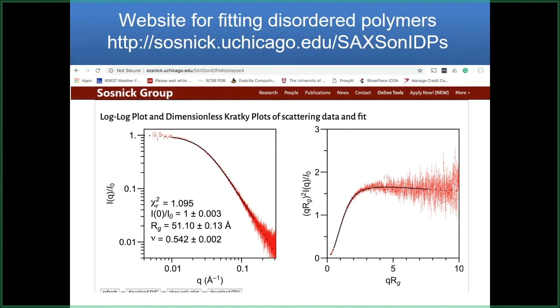So this is just, I'd say, a first step in getting a good handle on how to describe things. Over the whole polymer, this is an average, and you might say that's probably right. If you fit mixed systems, then you're probably, at high Q, sensing more the random walk part, because you sort of have this plus this going out, and then you get that.